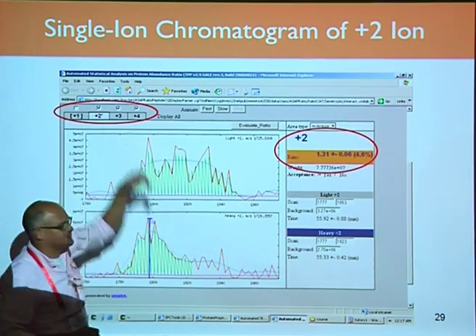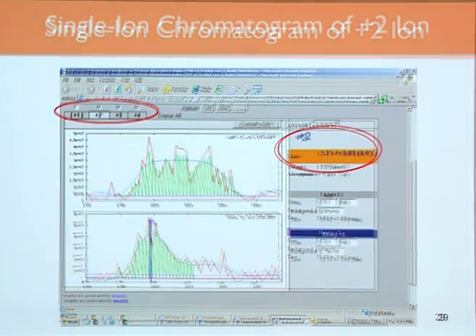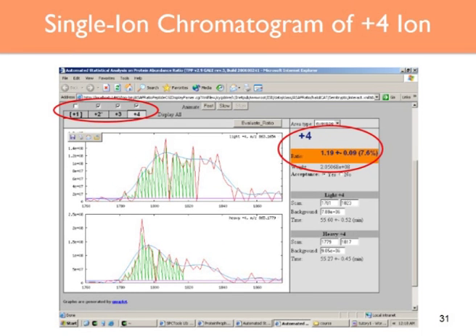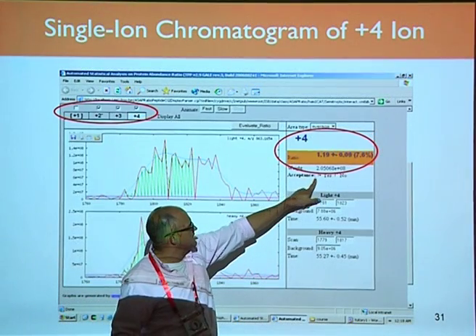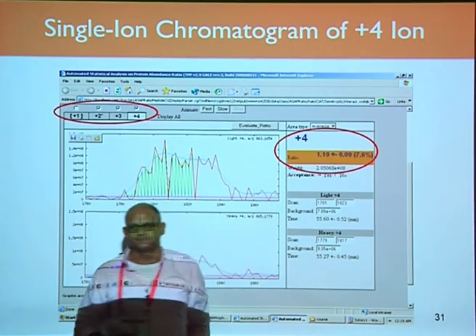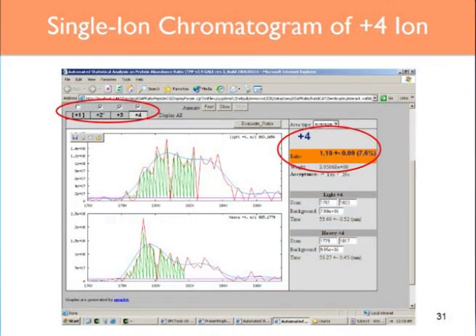Combine them and you get the unique ratio. That is actually not shown here. It's above in this page. Whenever you don't like a specific charge state or ratio, you can just turn the acceptance to no, and it will just not include that in the calculation. Again, we'll be actually working with that in a couple of days. But you have a lot of control as to what happens here.